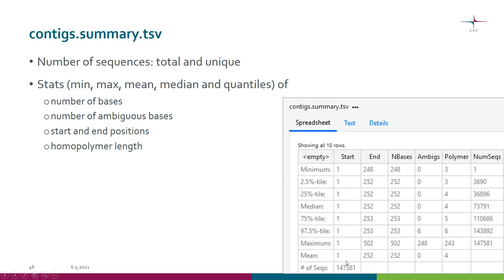After some later analysis steps it will also list the number of unique sequences. Then you have a lot of stats - the minimum, maximum, mean, median and quantiles of various things.